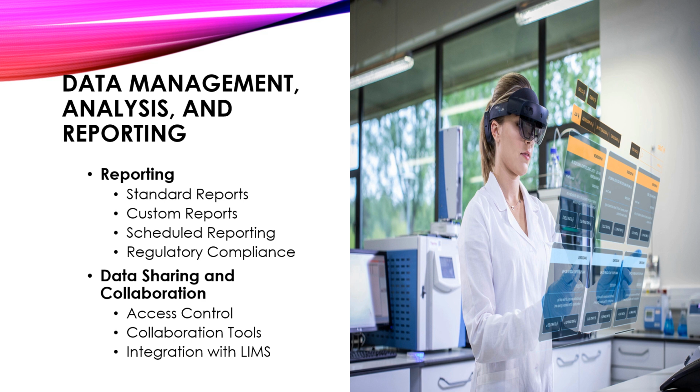Scheduled reporting. Laboratory management systems allow for the scheduling of reports to be automatically generated and distributed at specified intervals, reducing manual effort and ensuring timely reporting. Regulatory compliance. Laboratory management systems ensure that reports generated comply with regulatory standards such as good laboratory practices, good manufacturing practices, and ISO standards.